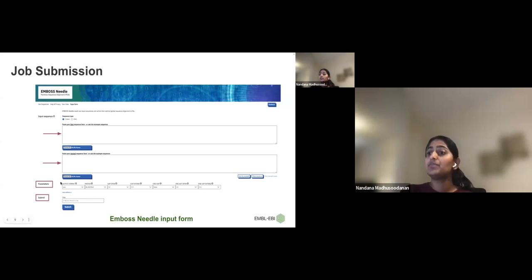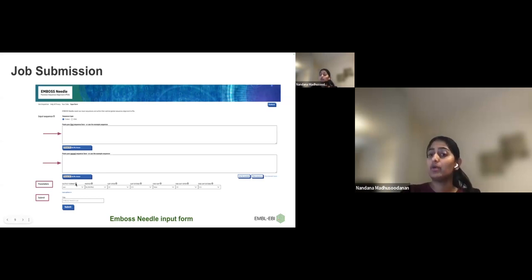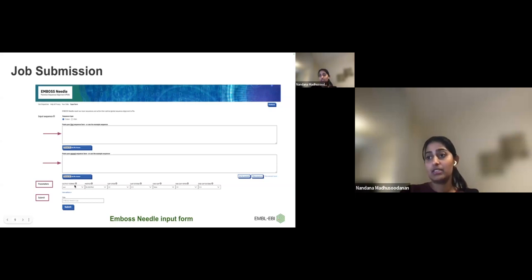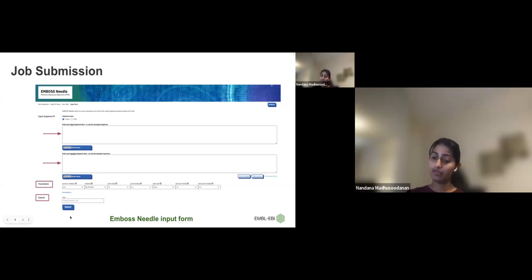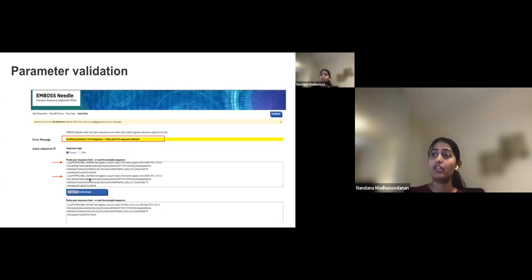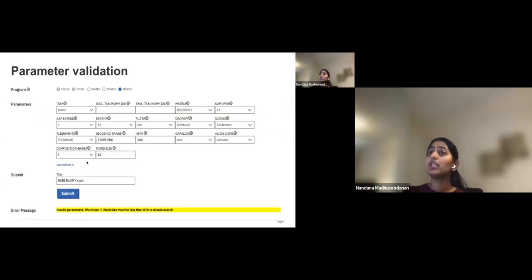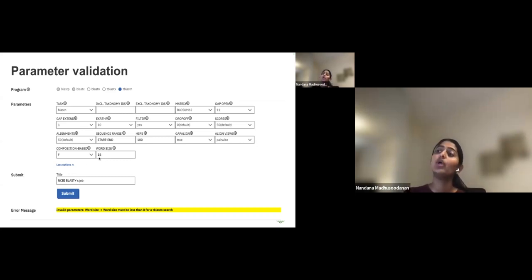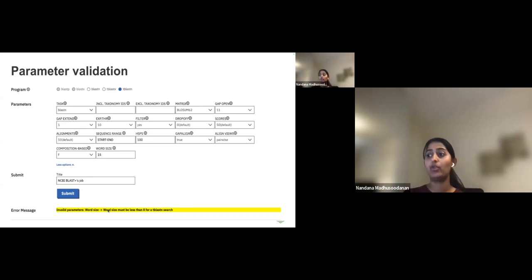You can click 'More Options' to see the parameters. If you're unsure what a parameter means, mouse over the information icon for a description. You can provide a job title if you want. Before submitting, we do parameter validation — for example, if you try to input two sequences in one text box for a pairwise alignment, we'll warn you that only one sequence should be provided there.